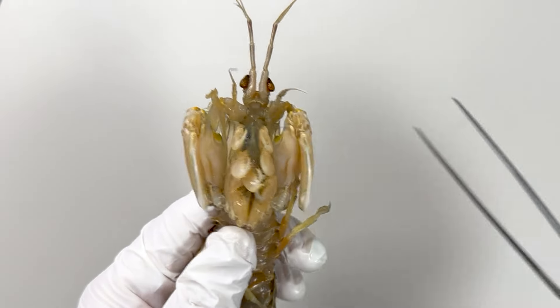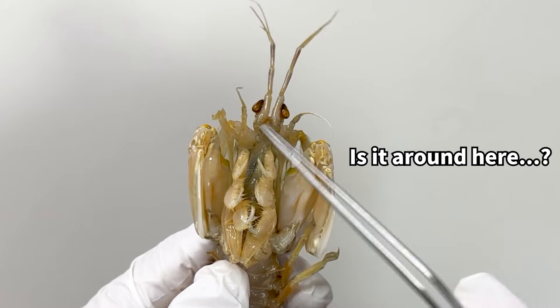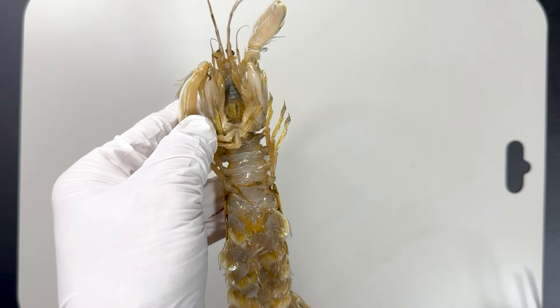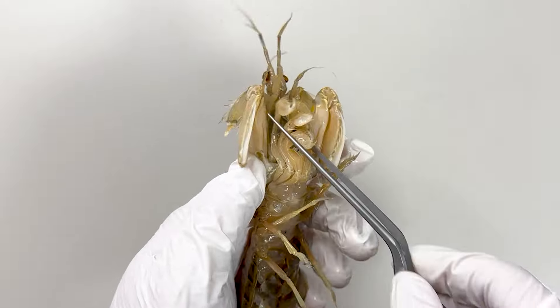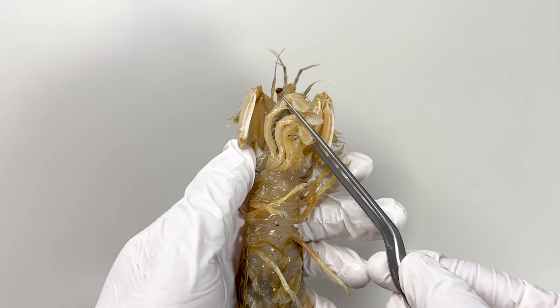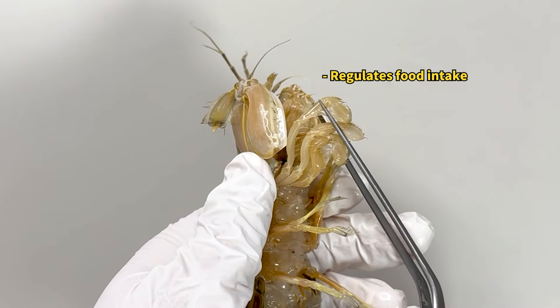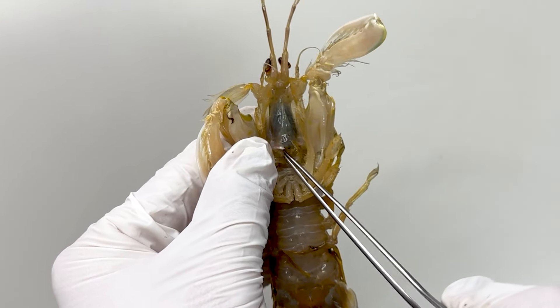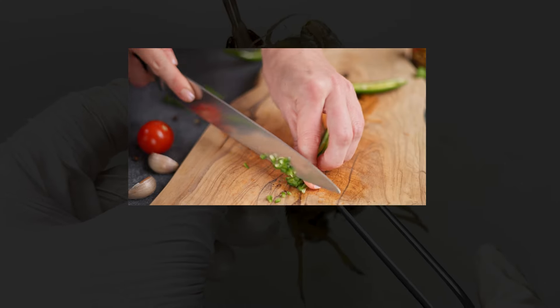Now, where is the mouth of the mantis shrimp? I thought it would be right under the eyes, but it's actually located further down, between the raptorial legs. Many appendages surround the mouth, similar to those found around the mouth of a crab, assisting in feeding. Inside these appendages are jaw-like structures that chop up the food into small pieces.